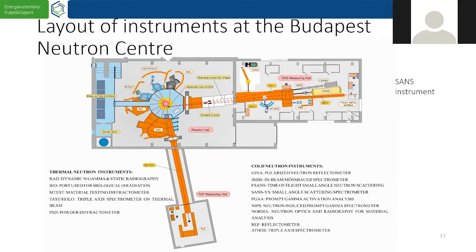What kind of neutron sources are usually used? That's the first one. And the second one is, can SANS and SAXS be used to study the polymer electrolyte membrane in the case of fuel cells? Yeah, for the second one, the answer is definitely yes. And there are many studies and many papers. So if you just search in Google, then you can certainly find them. Usually small angle scattering, SANS or SAXS, gives the organization of the polymer inside this membrane.